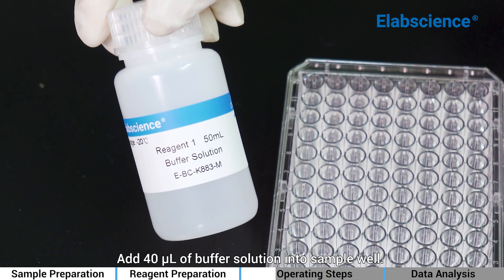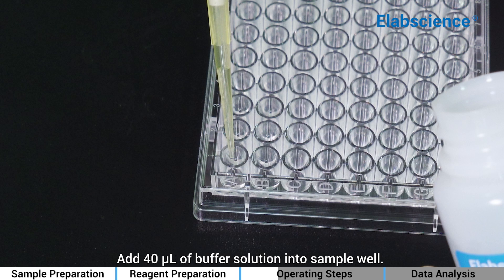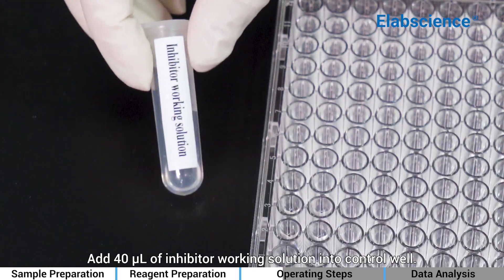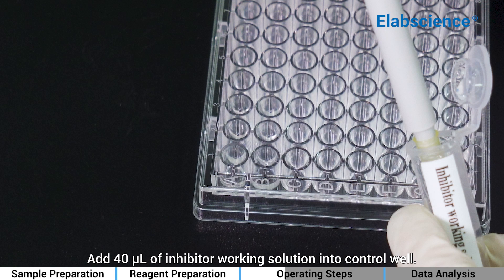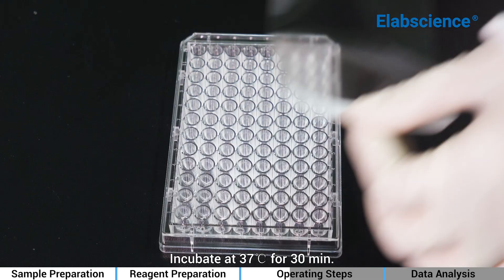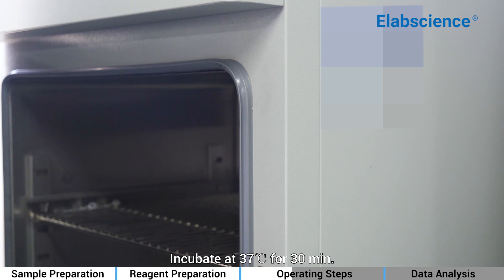Add 40 µL of buffer solution into each sample well. Add 40 µL of inhibitor working solution into each control well. Incubate at 37°C for 30 minutes.